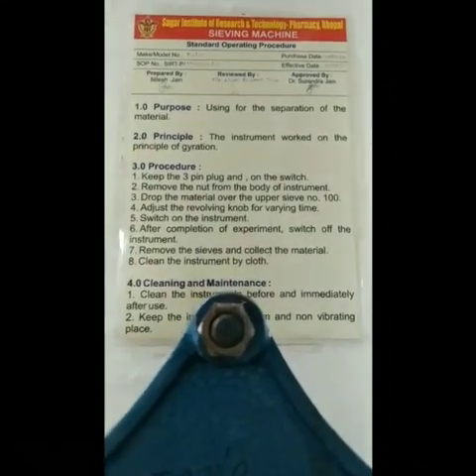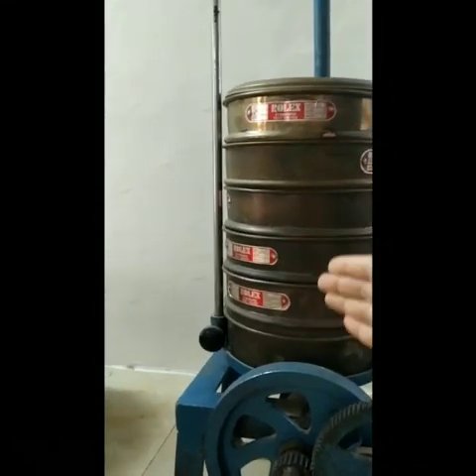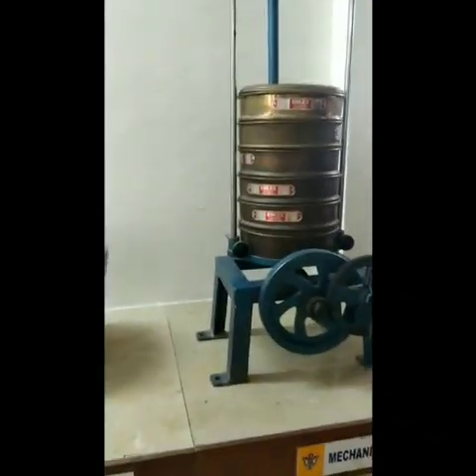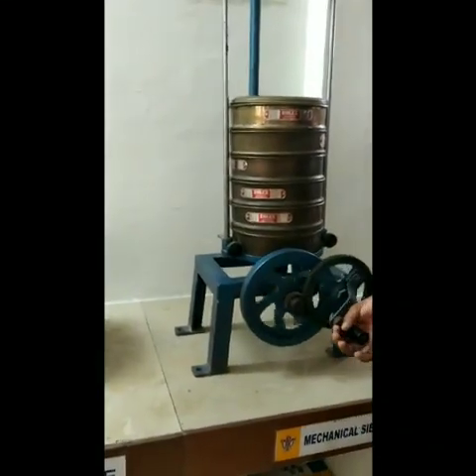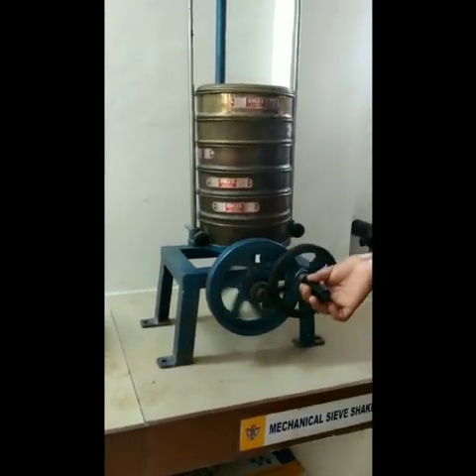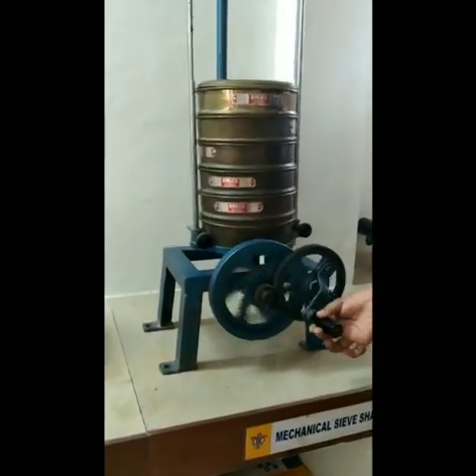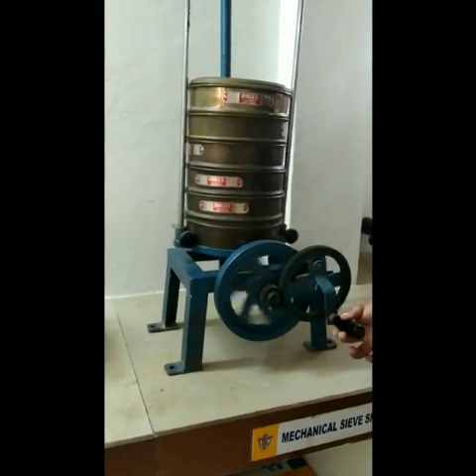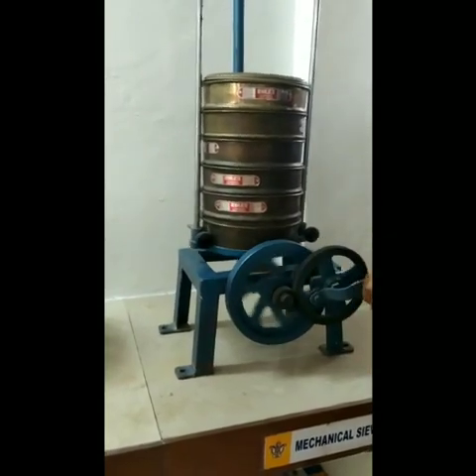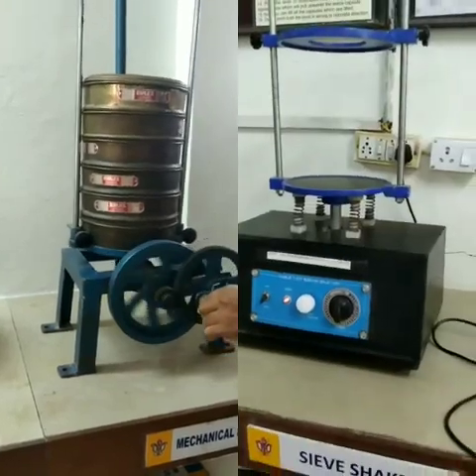For separation of material, sieves are arranged in this manner. We will give a demonstration of how to use this. First we will fit our screens and then by moving this, the instrument operates. This is the working procedure for this mechanical sieve shaker, and it works under the principle of gyration.